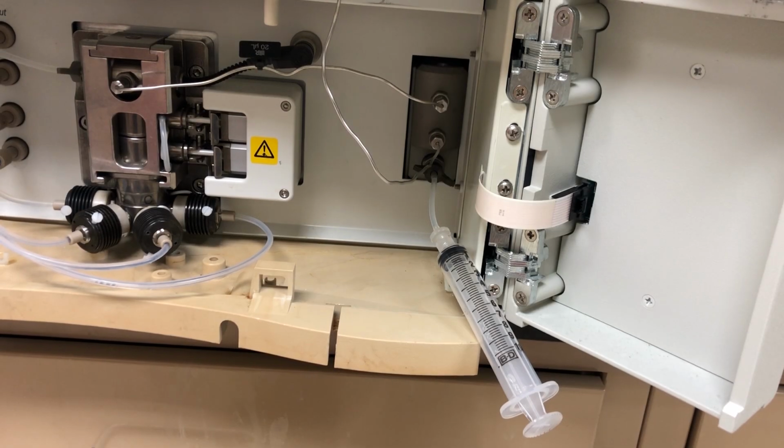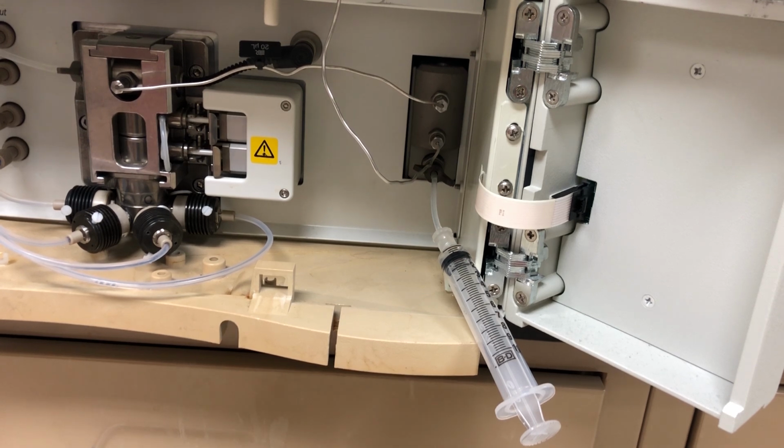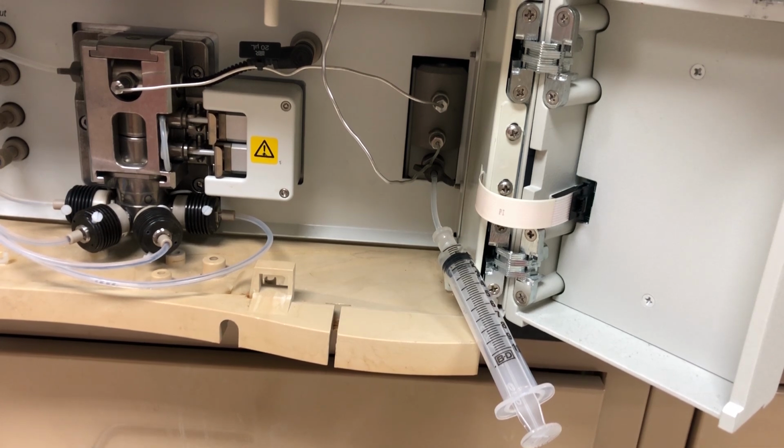Okay, so here you can see the pistons pushing, and this is a valve on the output that I have opened up so that it's not going to the column, it's going to here. And you can see these guys pushing against the back pressure. And we often use this syringe to make sure that we're putting out what we're supposed to be putting out. This guy's at 2 mils a minute, so you can sit there with a timer and you can watch the syringe fill up.